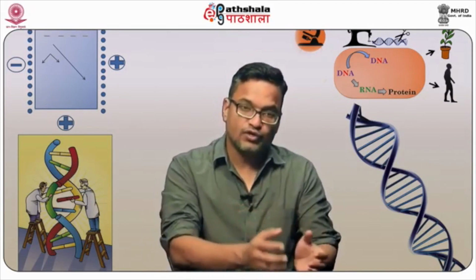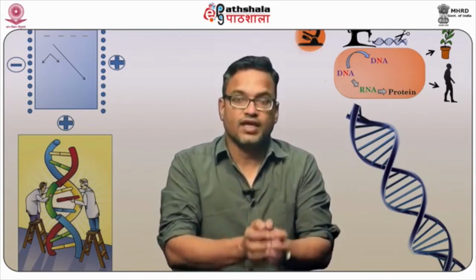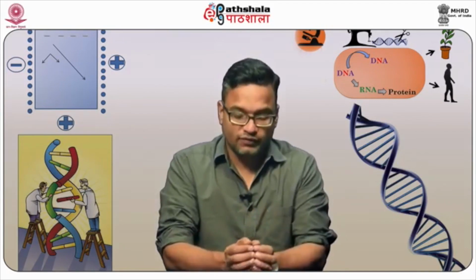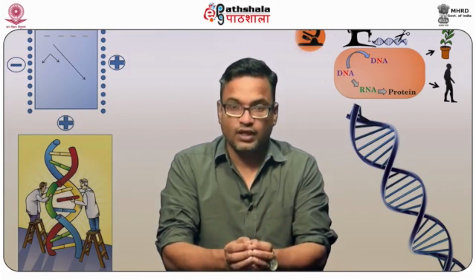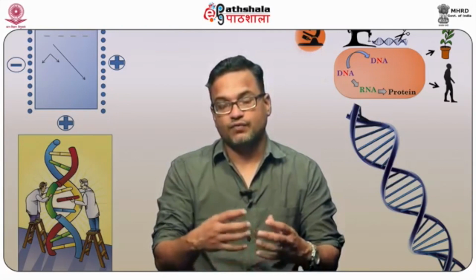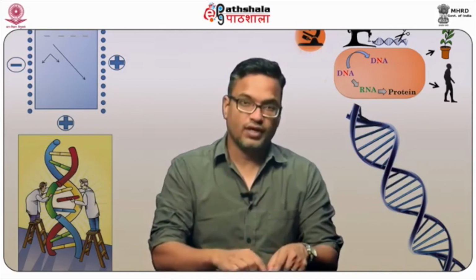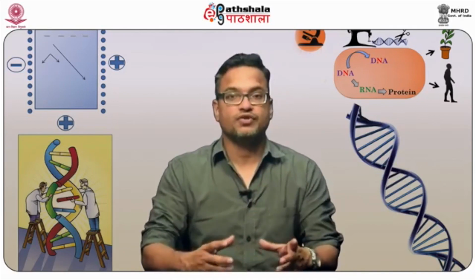It also allows a researcher to understand whether a molecule has a diffusion capability. If we are spotting a specific molecule at a specific location, we can see whether it is diffusing, and so figure out the diffusion coefficient. When a molecule has Brownian motion, moving from one location to another, we can figure out within that perimeter the diffusion coefficient of that particular molecule.